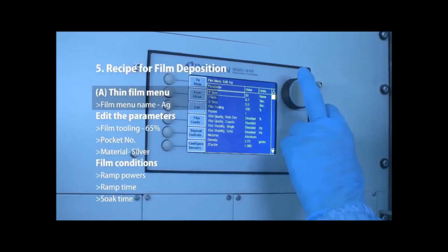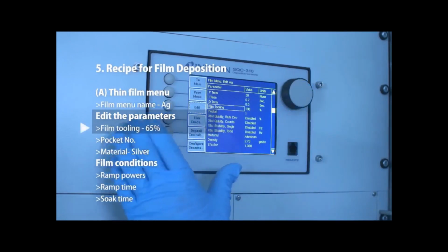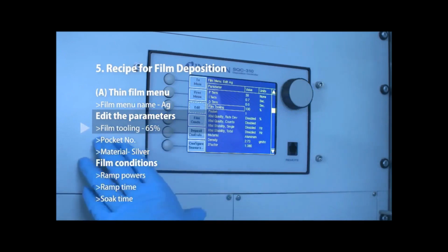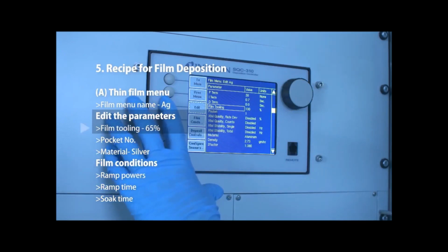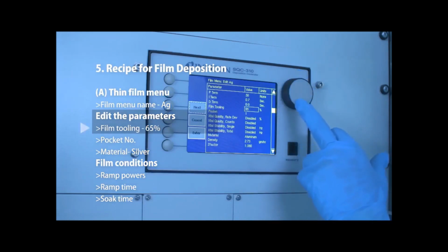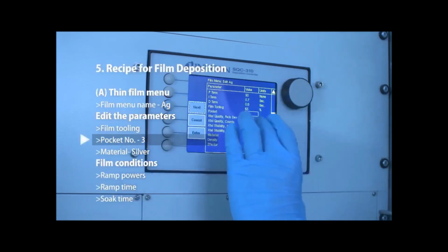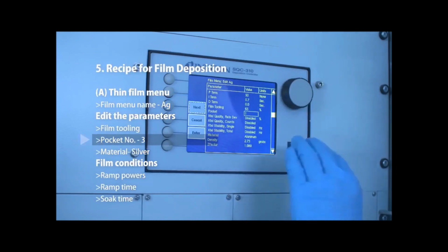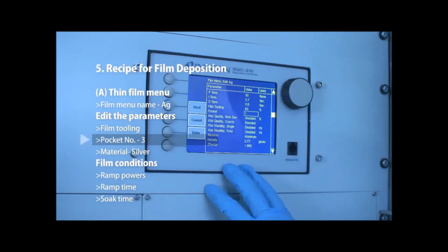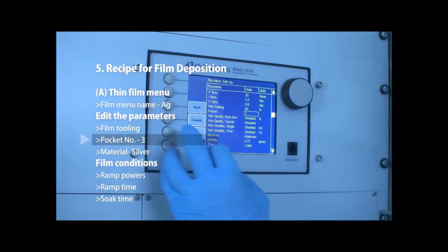For PID we don't need to change the parameters. For film tooling we have to set it to 65% because the height of the QCM is different from the substrate holder side, so we have to edit it here. We change the knob so that it comes to 65%. Next is the pocket. This is the cavity in which we put the graphite crucible with our sample. We put silver in our pocket number 3, so we have to select 3.